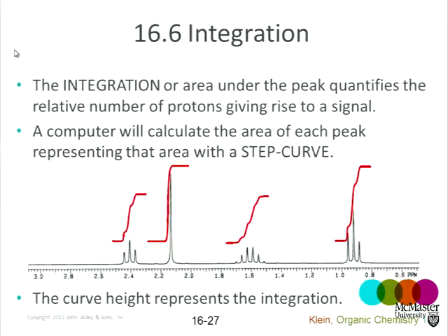4 different types of hydrogens. One environment up here at about 0.9 ppm. Look it up on the table. That's an alkyl group with nothing attached. That's electronegative. 1.6 ppm. Something is shifting those protons to 2.4, right? So there's different protons in different environments. The chemical shift tells me about the environment. But it doesn't tell me how many protons there are in each of those environments.